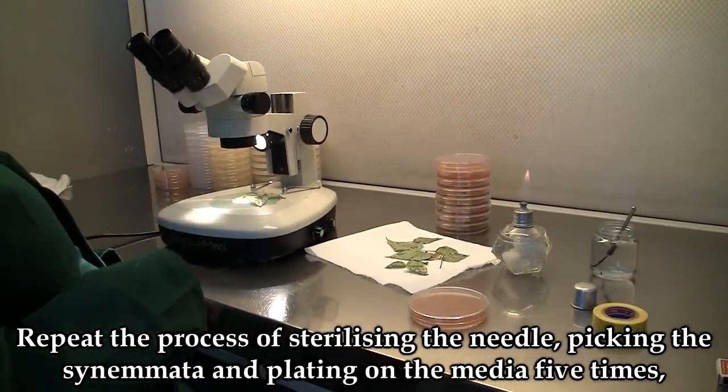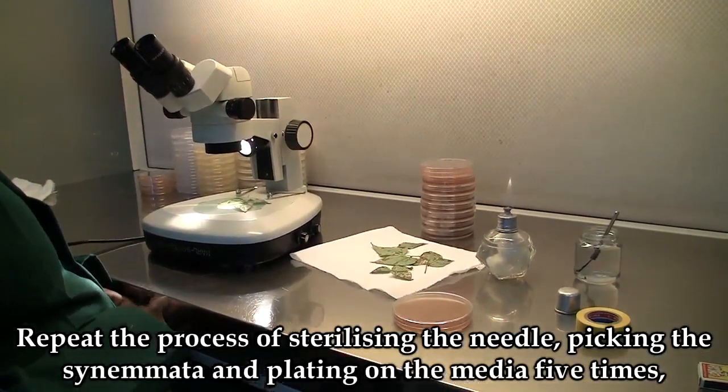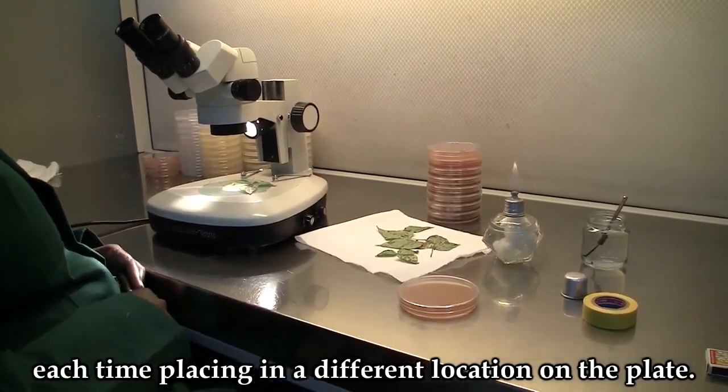Repeat the process of sterilizing the needle, picking the conidia, and plating on the media five times, each time placing in a different location in the plate.